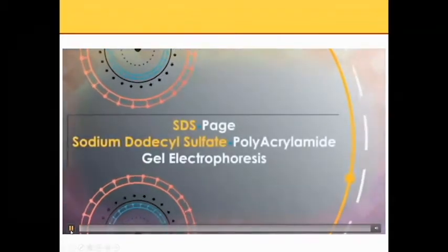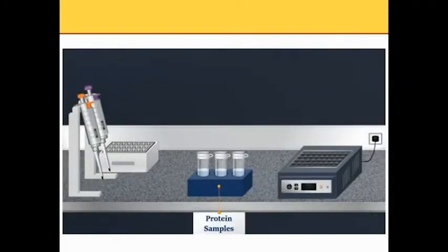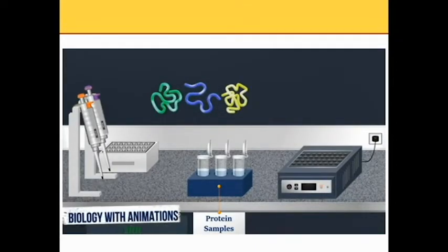SDS-PAGE, or sodium dodecyl sulfate polyacrylamide gel electrophoresis, is an electrophoresis method and a very powerful technique in the study of proteins. In SDS-PAGE, proteins are separated in a polyacrylamide gel based on their molecular weight.